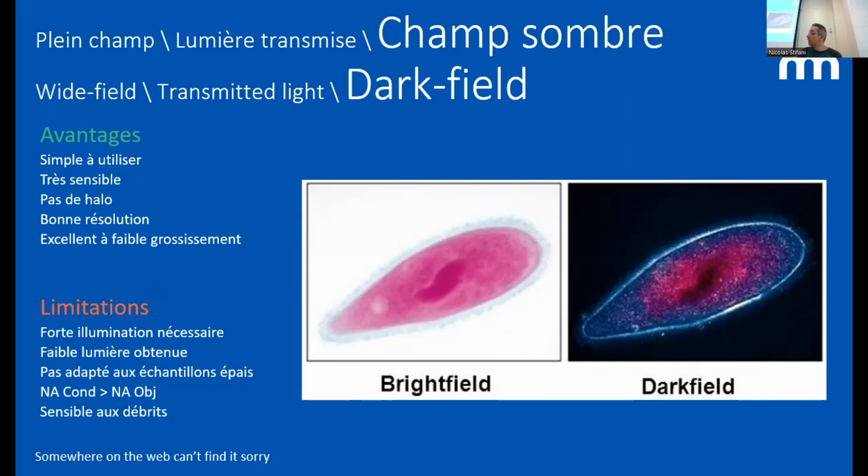Nanoparticles, we can visualize with dark field. Oh, and Prio is saying that he's using a lot of dark field. Thank you, then you're gonna be my demonstrator for next time. And he used it for unstained brain sections, and it works great. Thank you for backing me up.